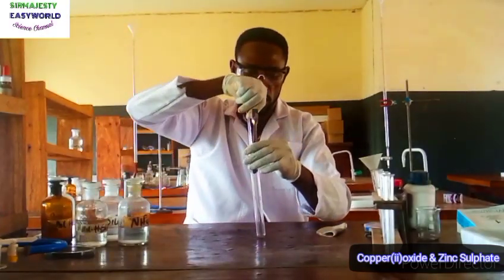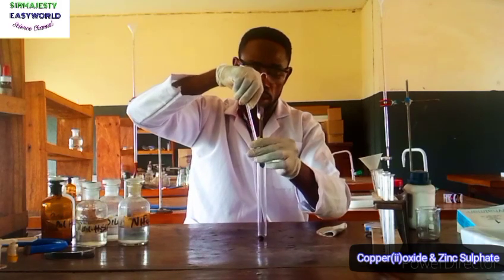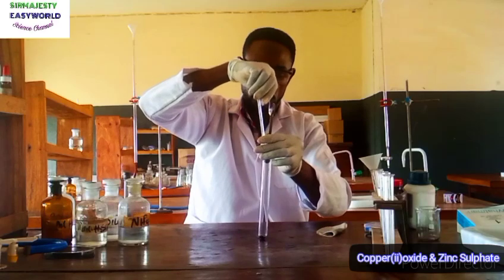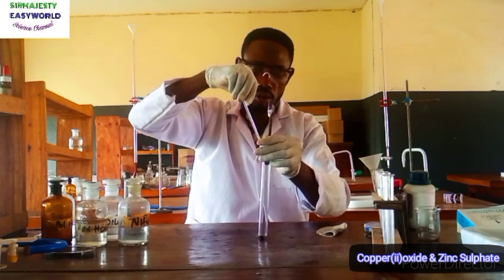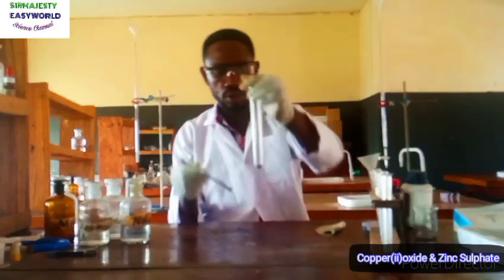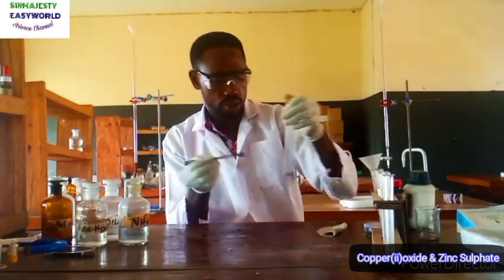We have gotten it into this boiling tube. That's the black residue there.